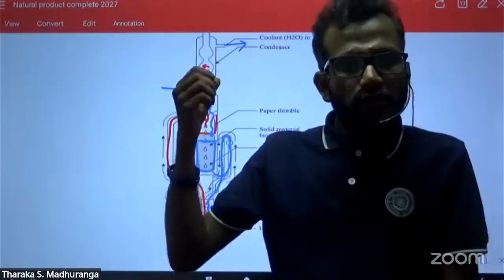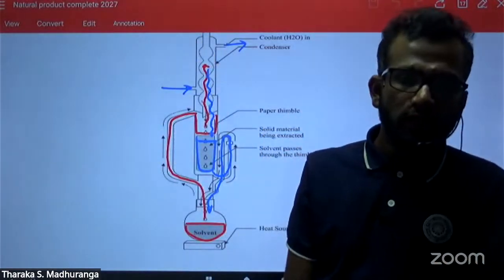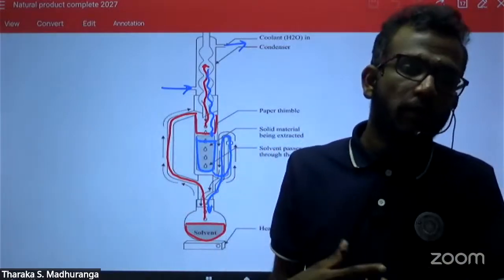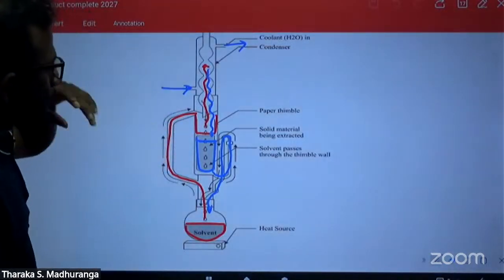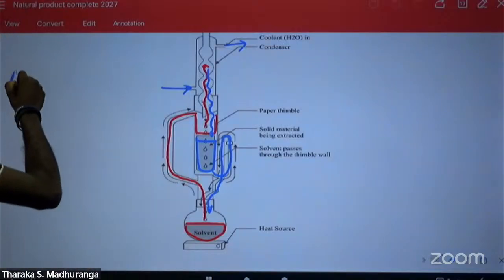I told you the solvent vapor temperature is higher than the liquid. Therefore, that's also an advantage to get the maximum amount of compound into the solvent.